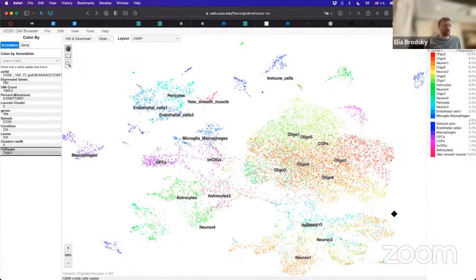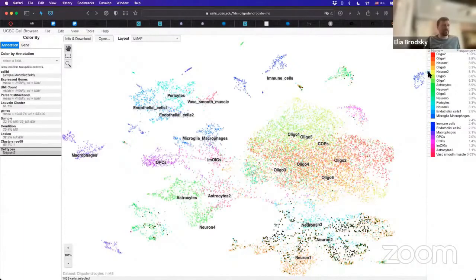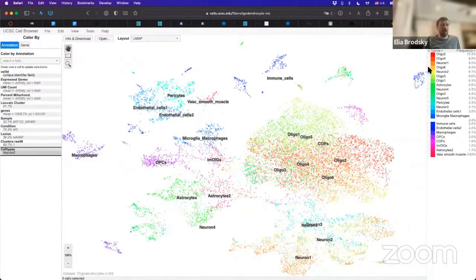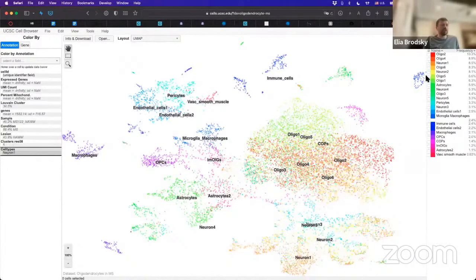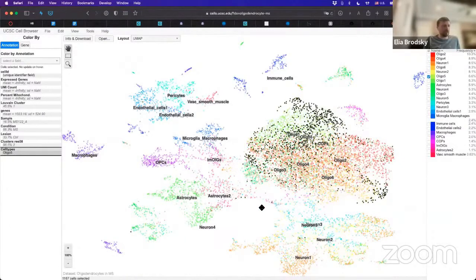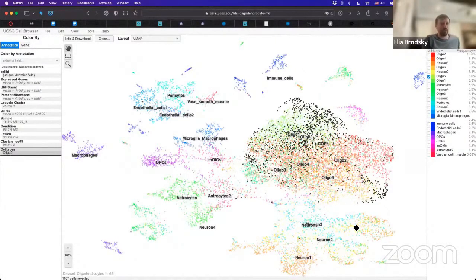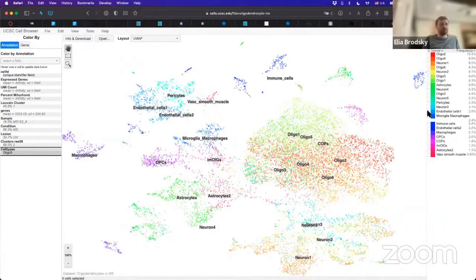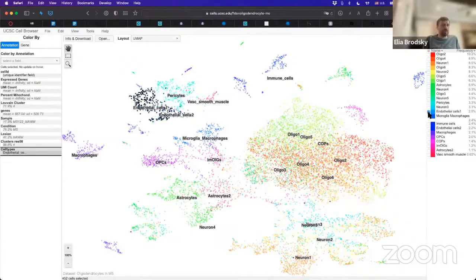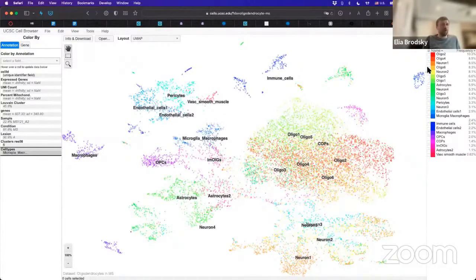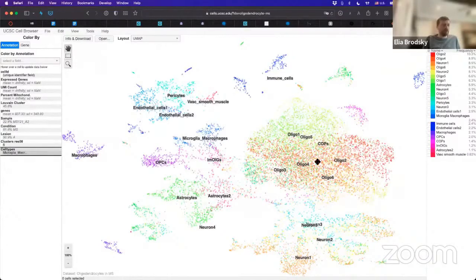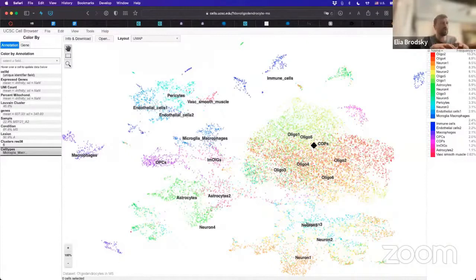If you actually select, they mix a lot between themselves. These are not clusters that are always very clearly defined. You can see that all of them are right here, but they're also found right here. So a lot of these types of references give us the strongest signal that we have. Not all of them are so clearly differentiated from each other. Some of them are, but not all of them.